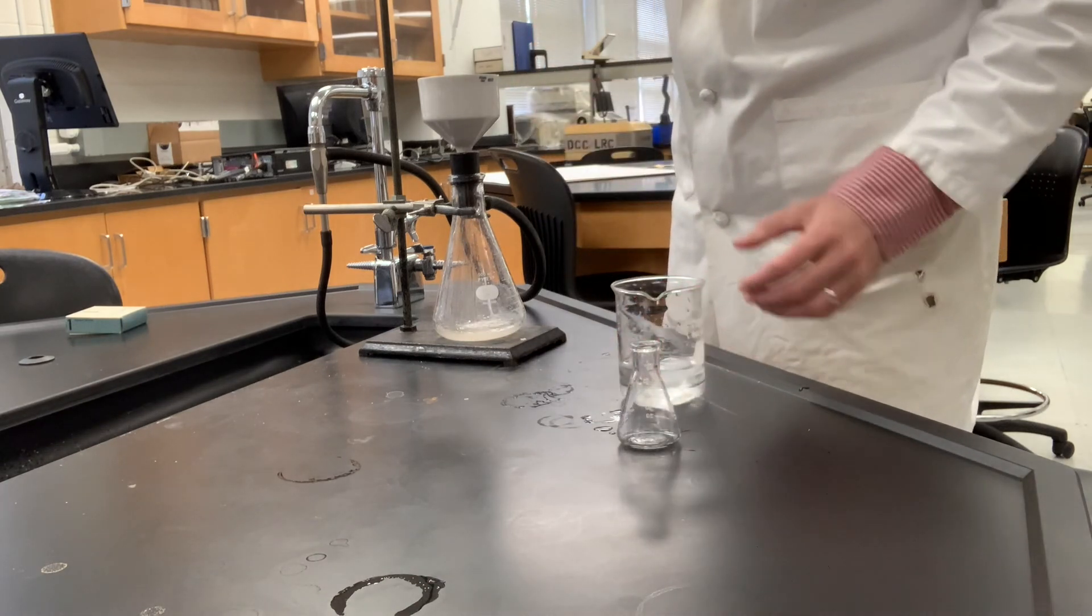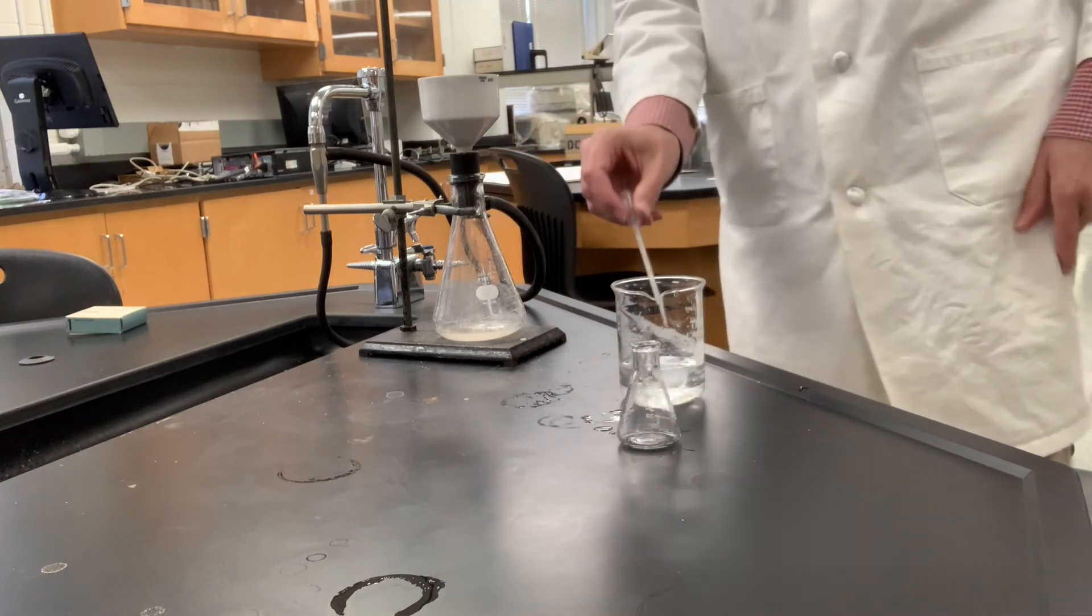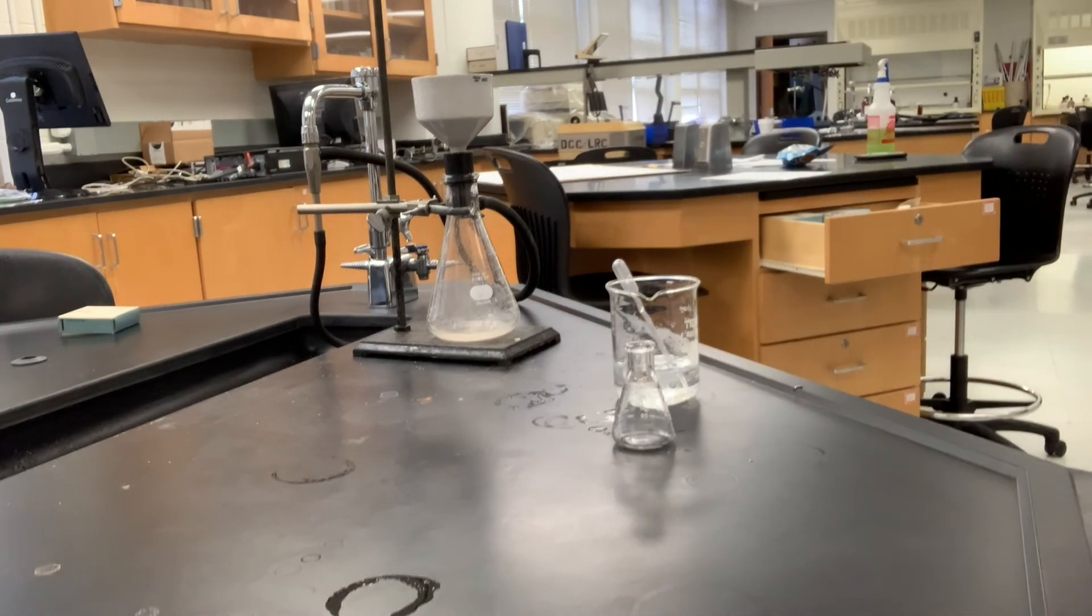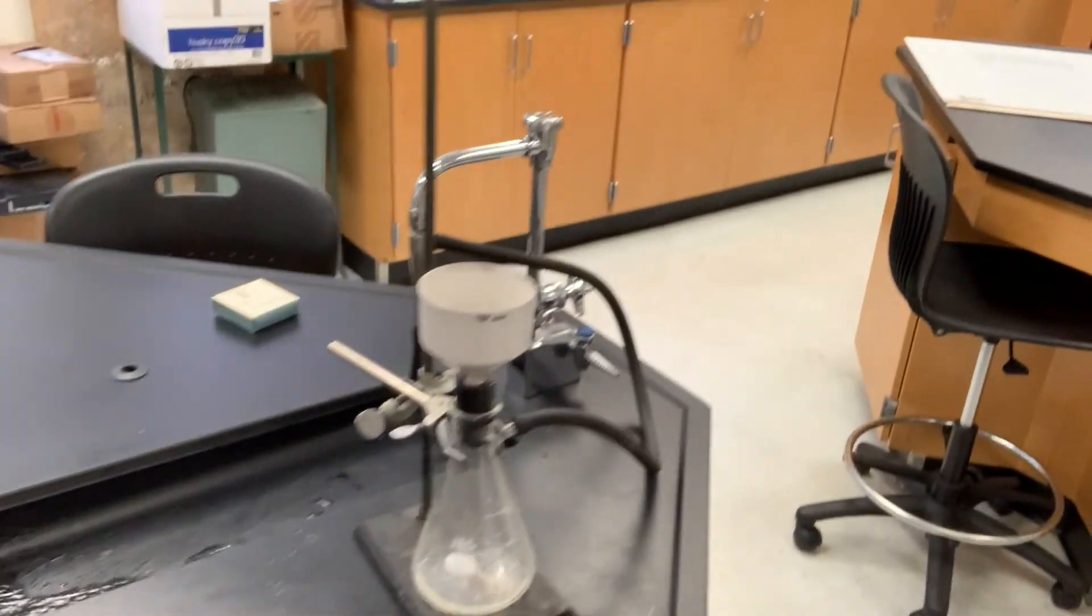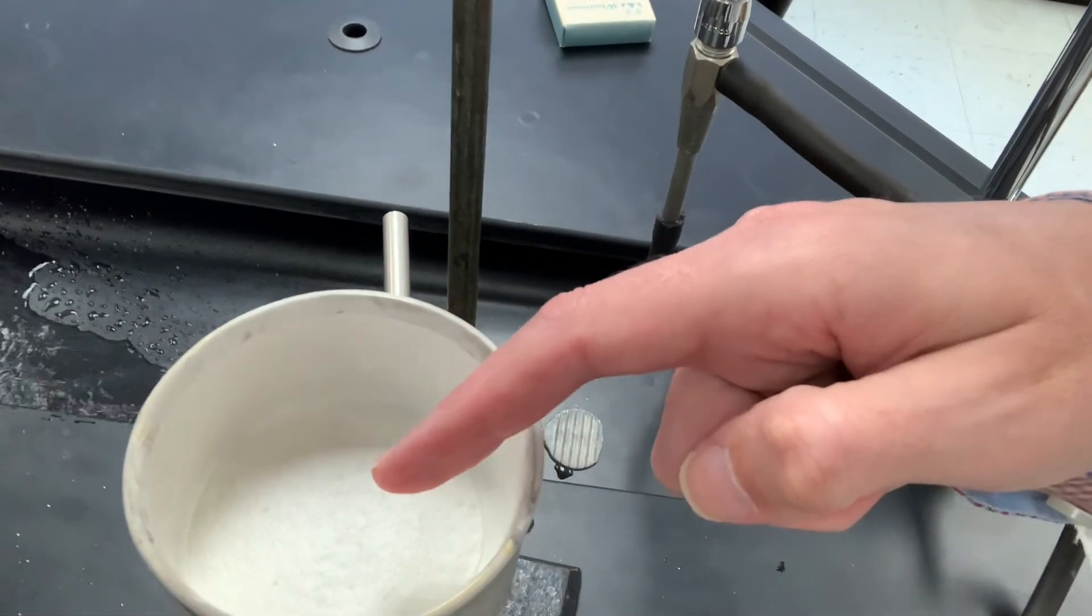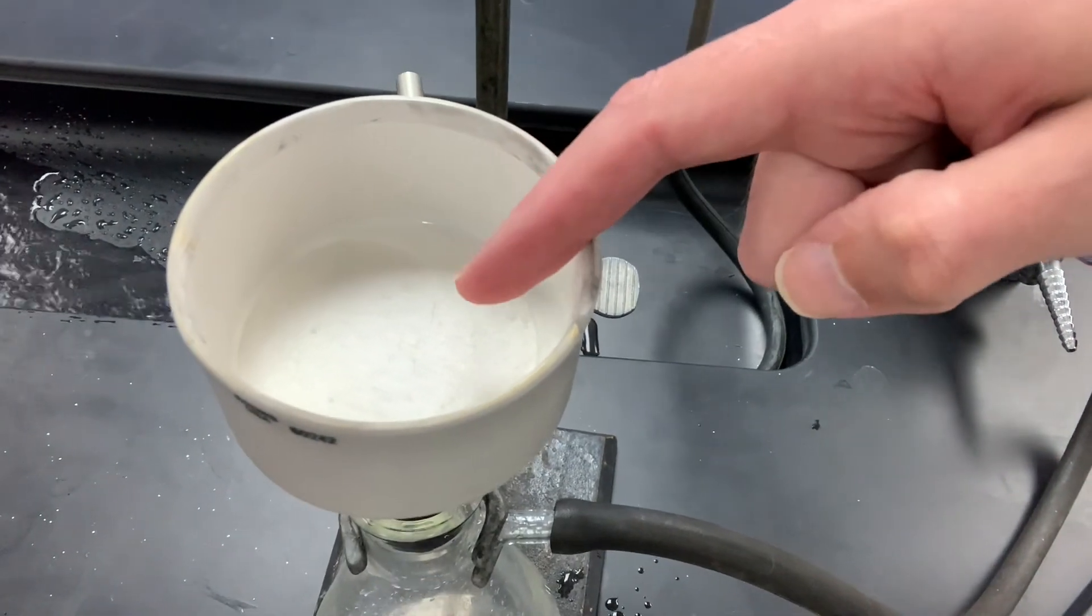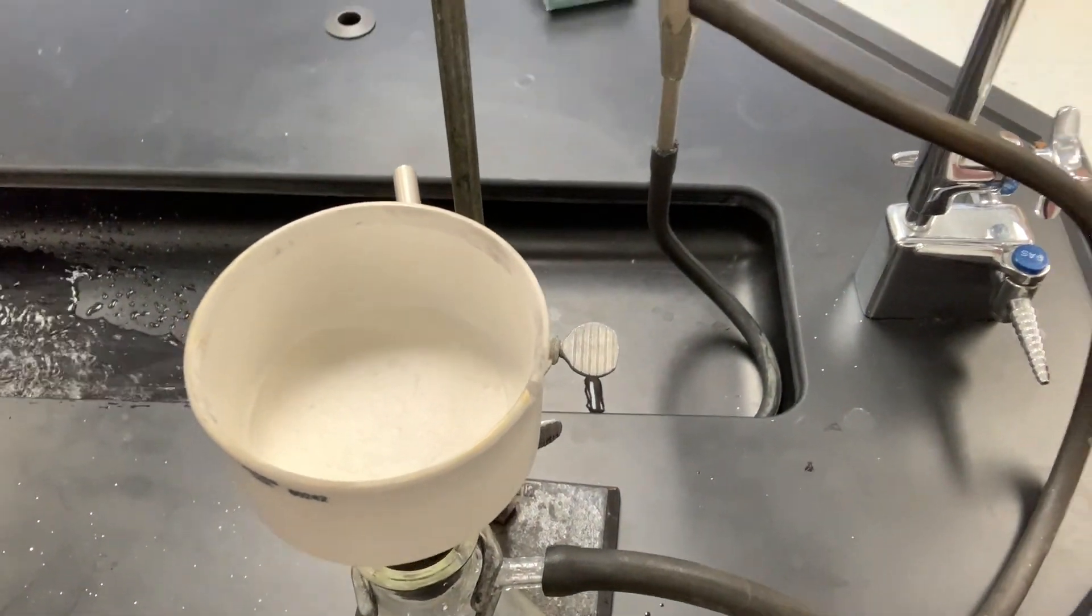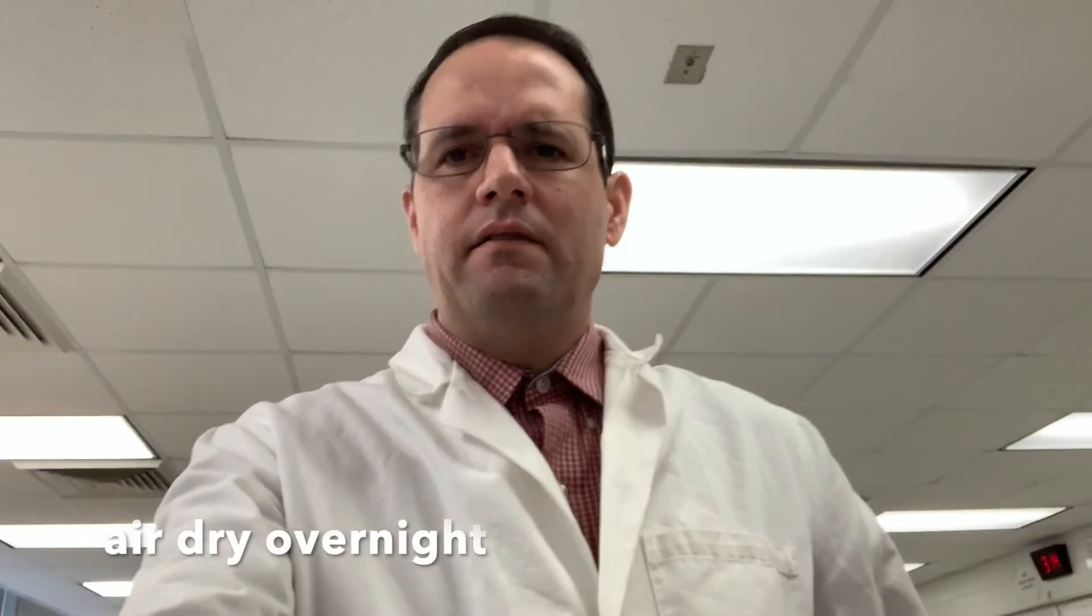You can see that ugly yellow brown color went away and we have a nice solid. The substance itself looks kind of waxy - it always does when I synthesize this. I'm going to let this air dry and you'll see the appearance when I pull it off the filter paper onto a watch glass. I'm going to let this dry overnight and then I'll take you on to the next step where I weigh it so you can calculate a yield and we'll do a melting point.